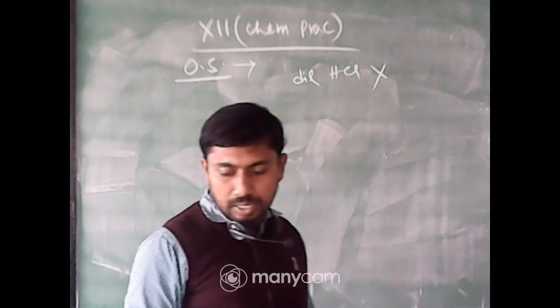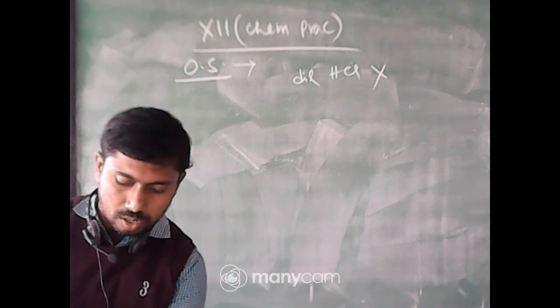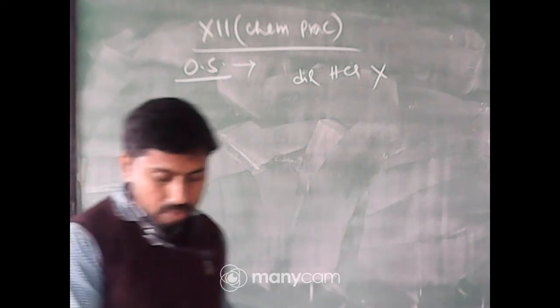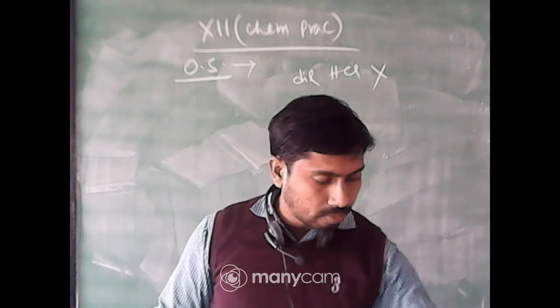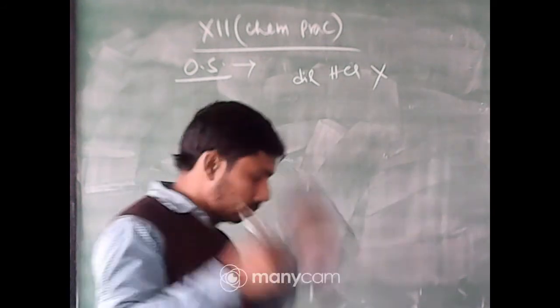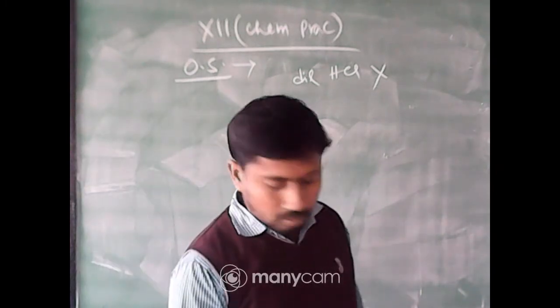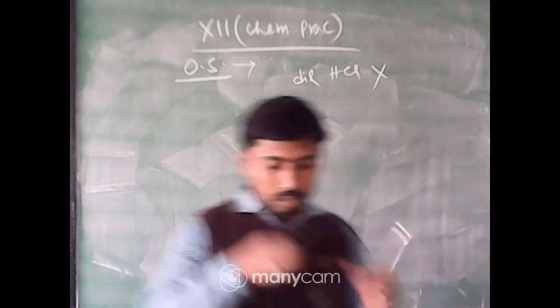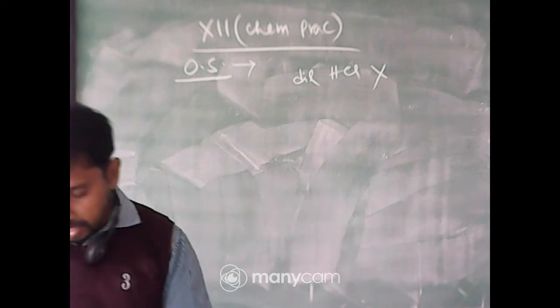We will try first with water. So I am taking the sample. The sample is taken in a test tube.